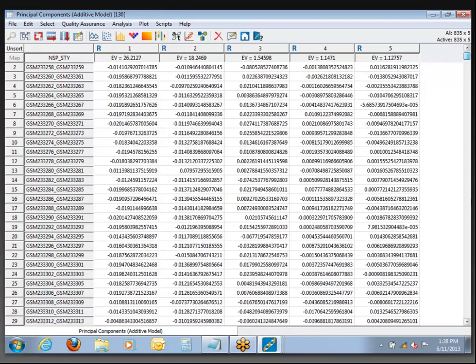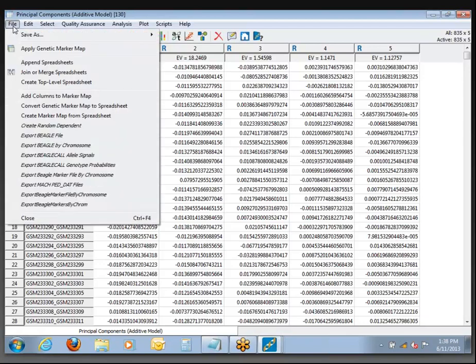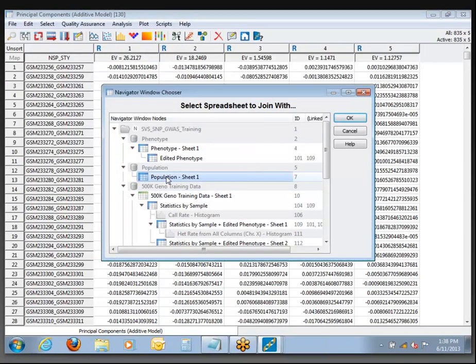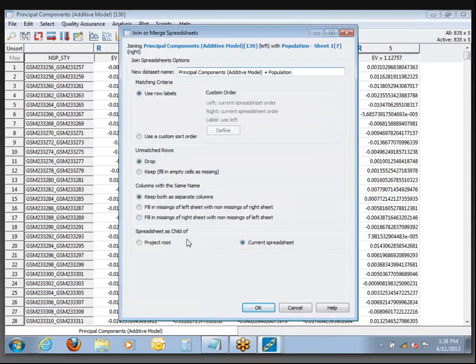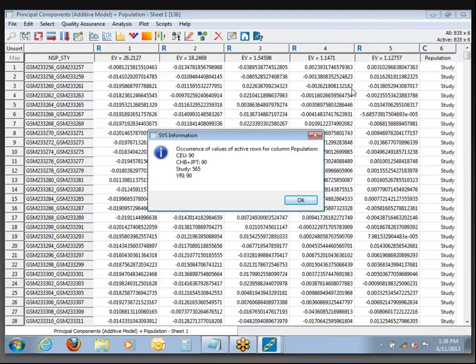What we want to do is merge these principal components onto the last spreadsheet in the bundle that we haven't looked at yet, and make plots where we can actually see the stratification in action. So if we come to File, Join or Merge Spreadsheets, you should have this second one in the list called 'population' — a pre-cooked spreadsheet where, joining with all default options, you should get a column with four categories: samples are either in the study population, Yoruba African, Chinese/Japanese Asian, or CEU Utah representing Northern European ancestry.